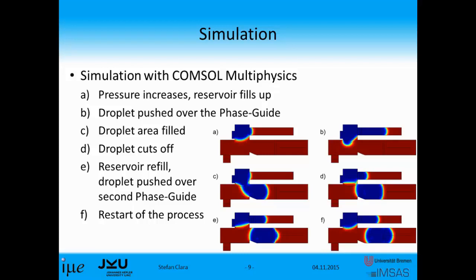And I simulated the behavior of the pressure chamber by applying a pressure inlet, where the pressure is dependent on the amount of fluid which flowed into this channel. If we start from position A, we see that the upper part is filled with the aqueous phase.